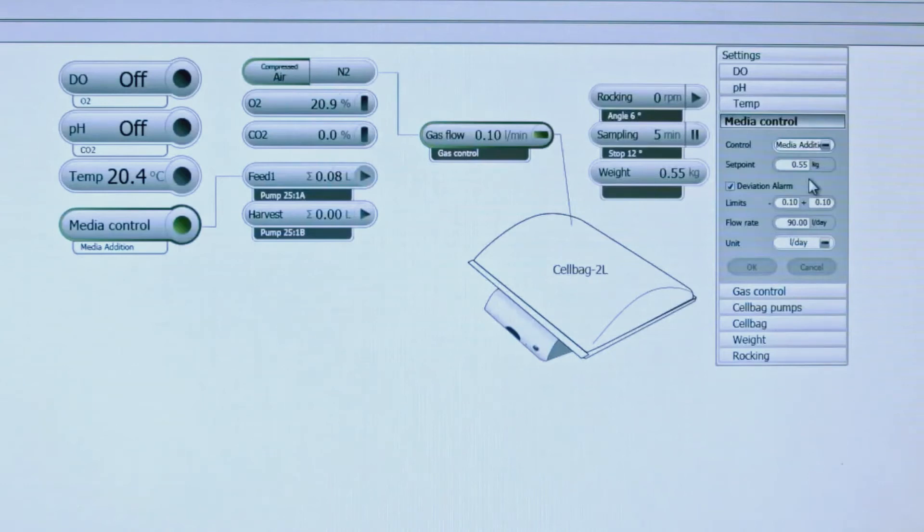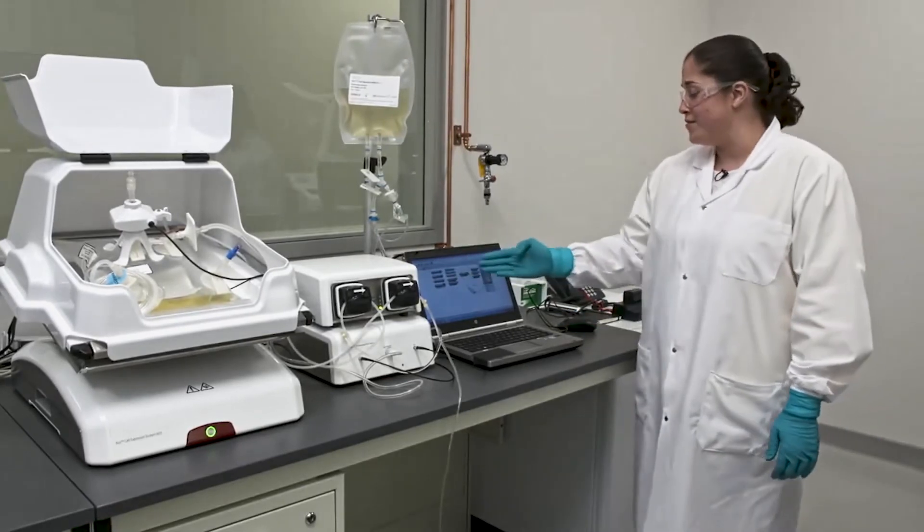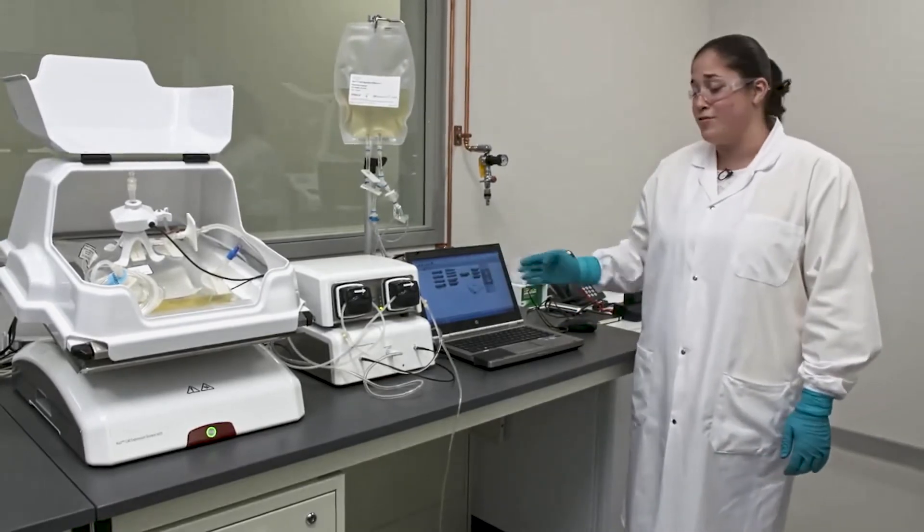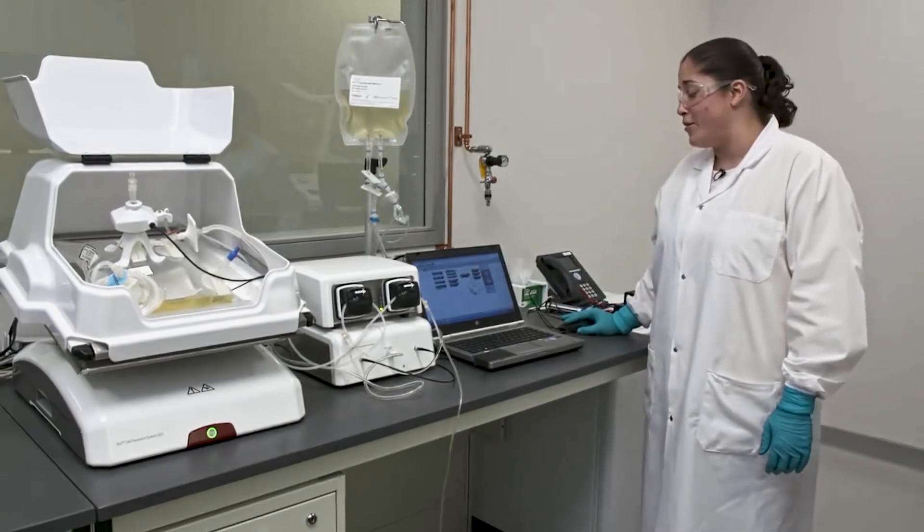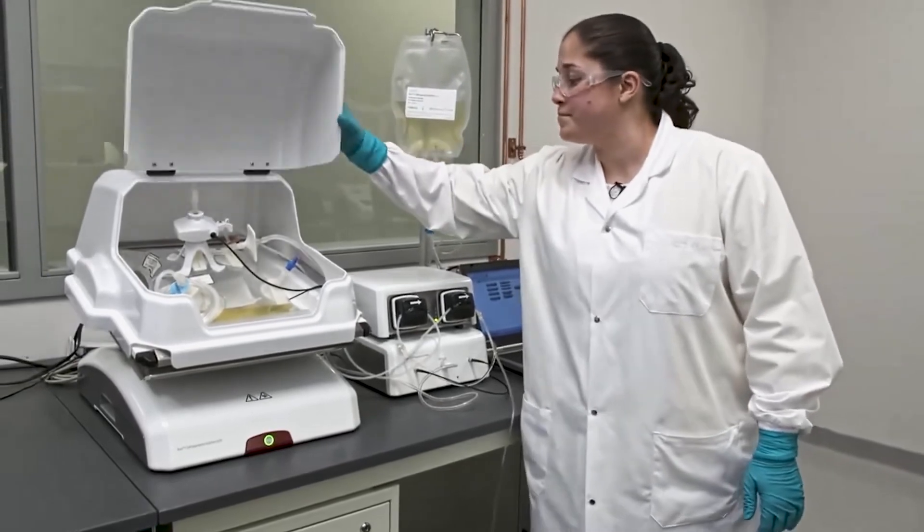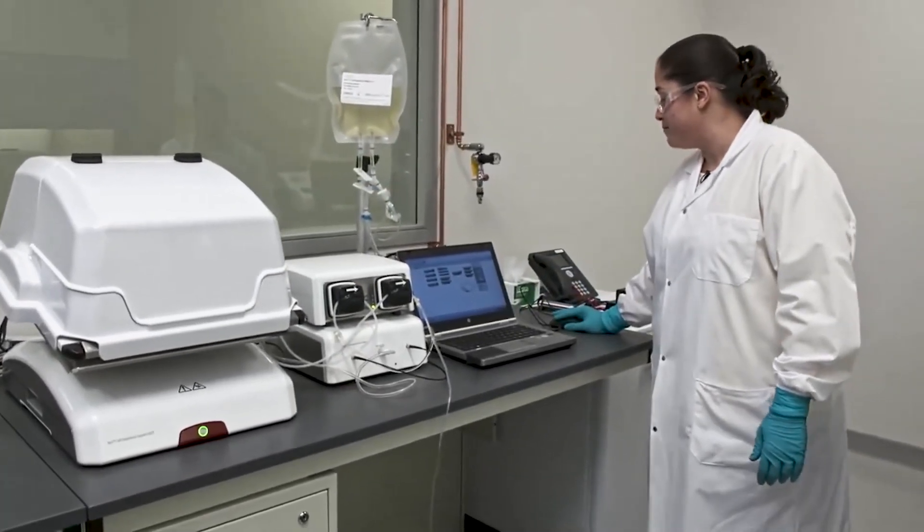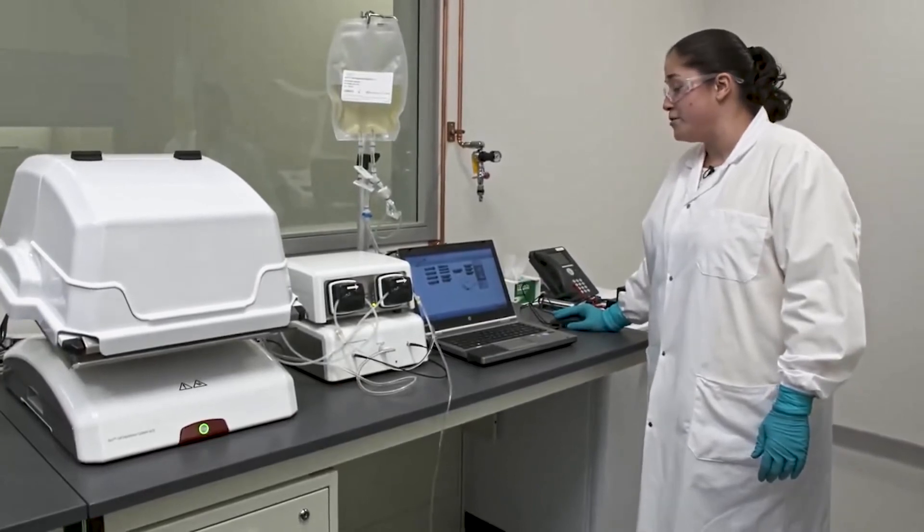Once media control has reached its target weight, which can be seen here, you can turn rocking on by clicking on the play button here as well as the temperature here. You can have your set points to whatever you would prefer. Once media control has completed, the pumps will turn off and you'll see that your weight set point is correct on Unicorn. You can then go ahead and turn off media control by clicking on the circle. You then want to close your cover and enable rocking by clicking the play button and turn on the temperature.